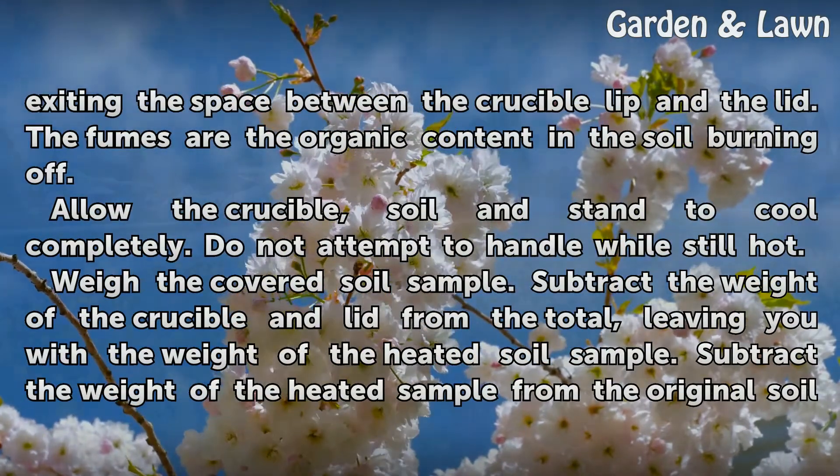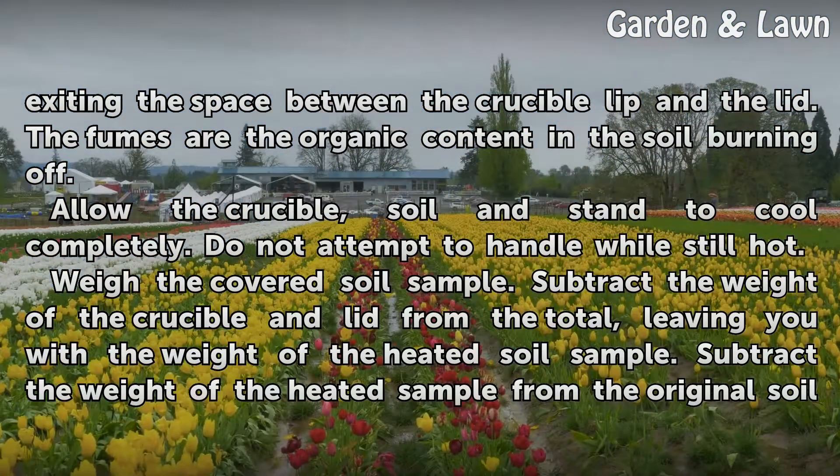Continue heating the crucible until fumes completely stop exiting the space between the crucible lip and the lid. The fumes are the organic content in the soil burning off. Allow the crucible, soil, and stand to cool completely.